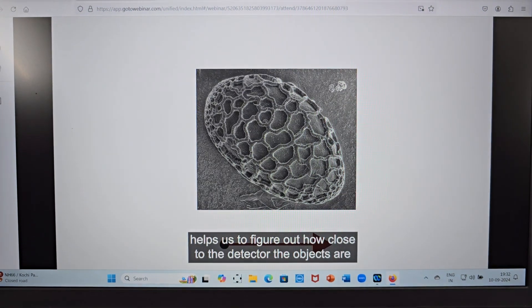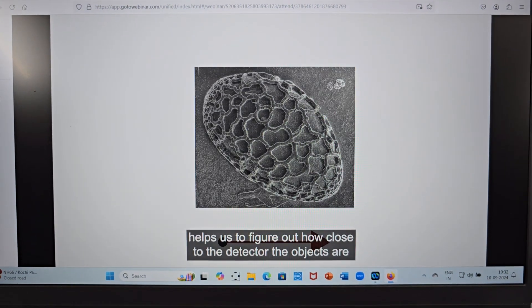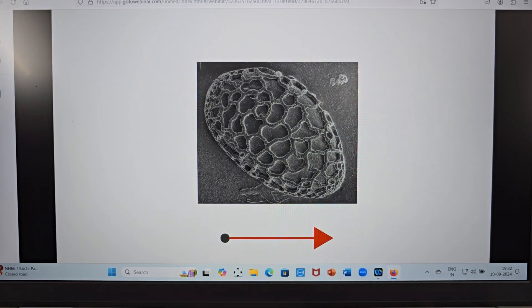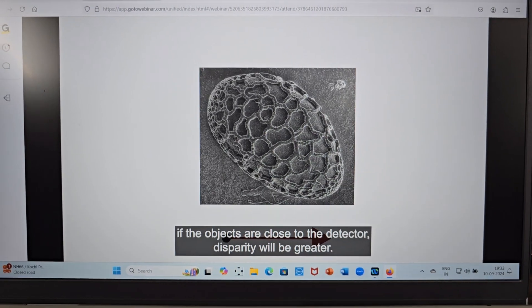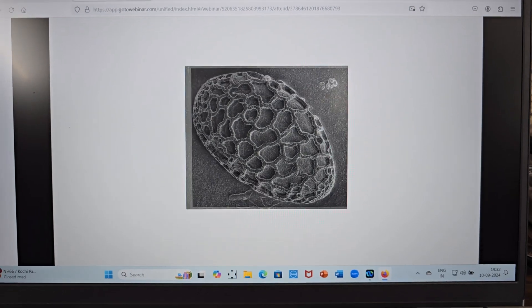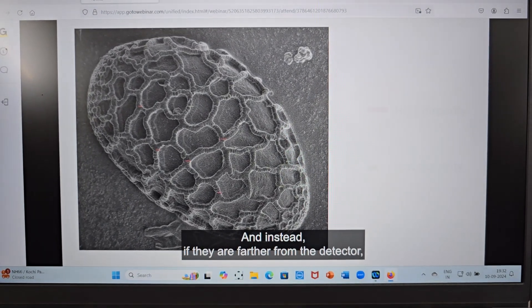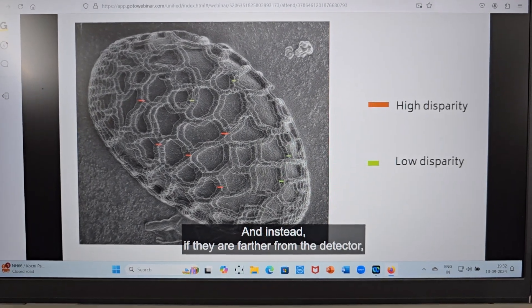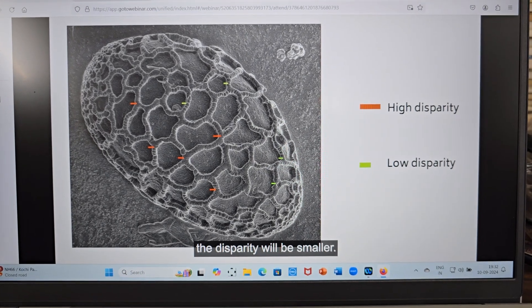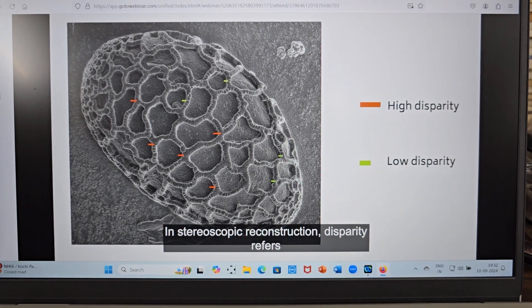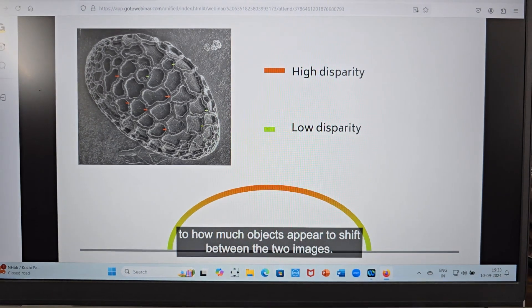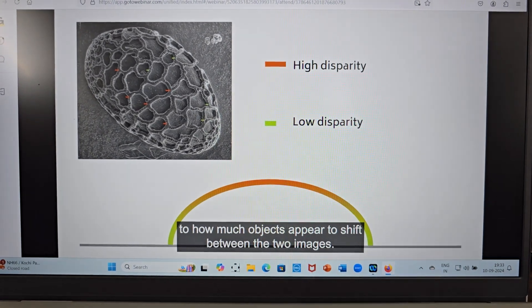This shift helps us figure out how close to the detector the objects are. If the objects are close to the detector, the disparity will be greater. If they are farther from the detector, the disparity will be smaller. In stereoscopic reconstruction, disparity refers to how much objects appear to shift between the two images.